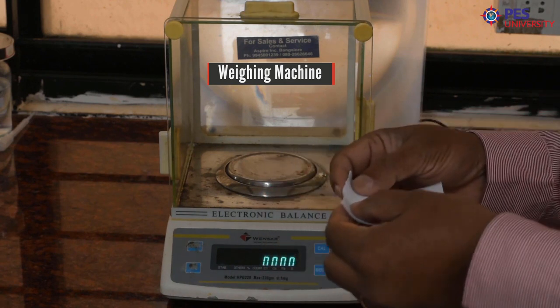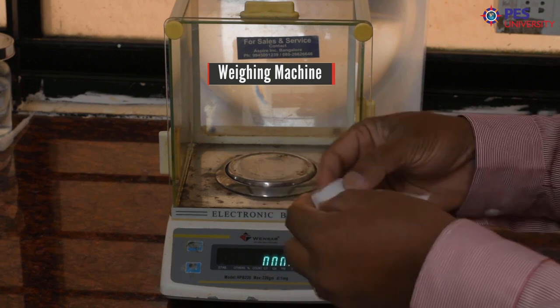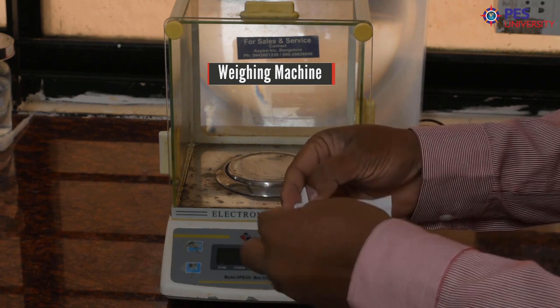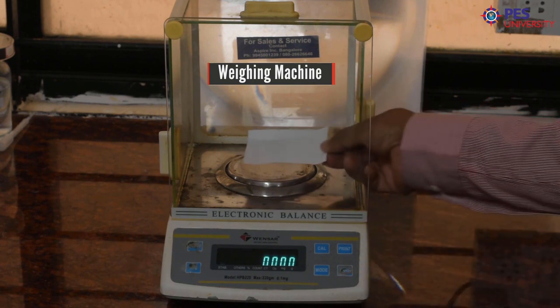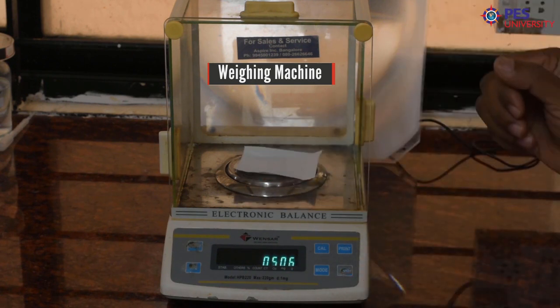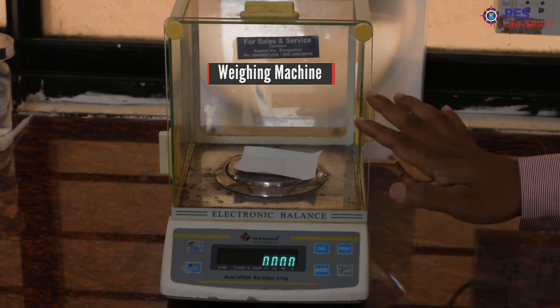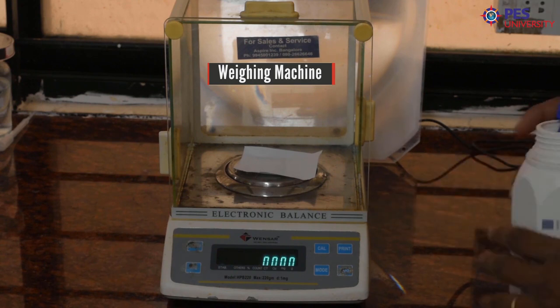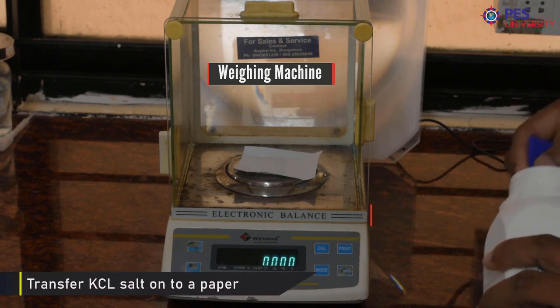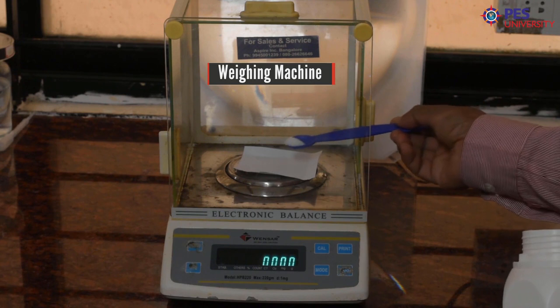take a sheet of paper, fold it like this. After folding the paper, keep it on a pan like this. Then press the tare button. Now the paper weight is 0. Then transfer KCl salt onto the paper like this.